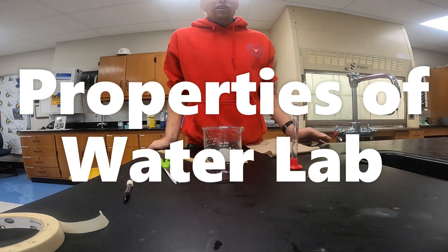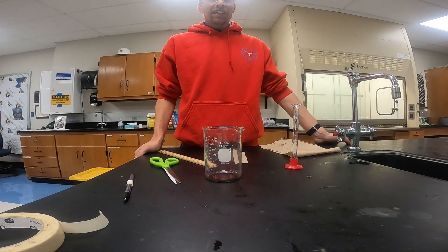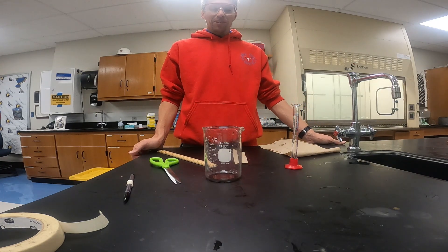Hello, and today in this lab we're going to be looking at some different properties of water. We'll run through a total of about 10 different stations to look at these properties.